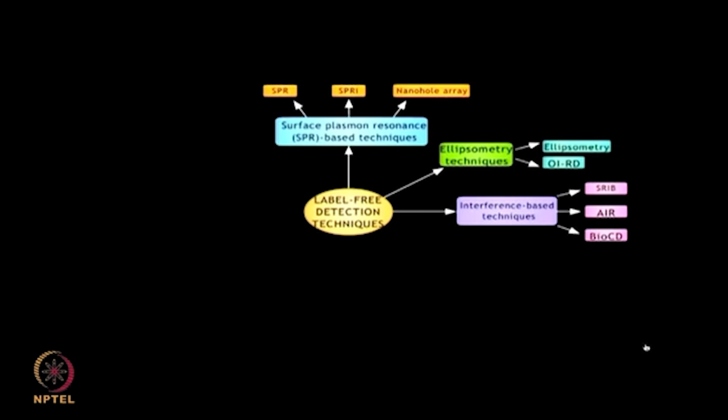Third, BioCD, biological compact disc. The local interferometry means the transformation of phase difference of wavefronts into observable interference fringes used for detection of protein capture.